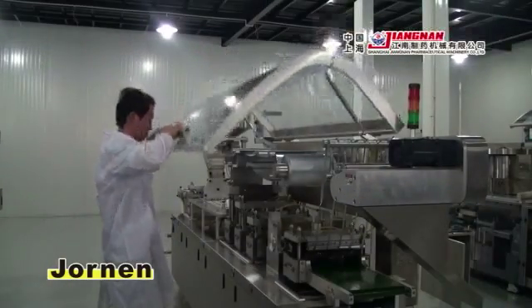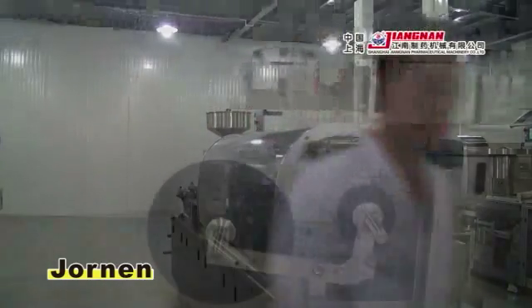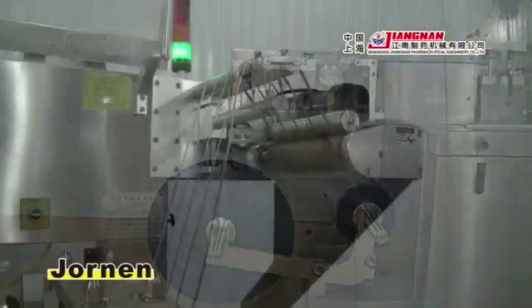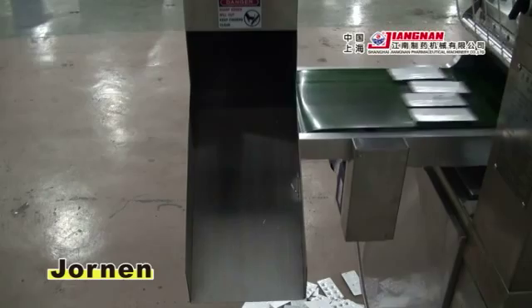Exquisite clear transparent cover assures safe operation. The machine can achieve 180 minutes of uninterrupted production, thanks to a forming material reel of up to 600mm in diameter and a waste material trimming cutter, which allow production runs of approximately 180 minutes.